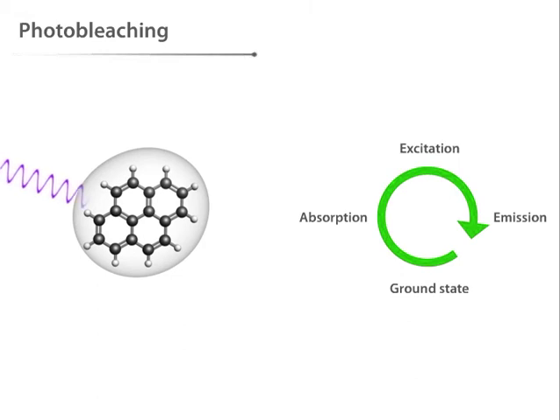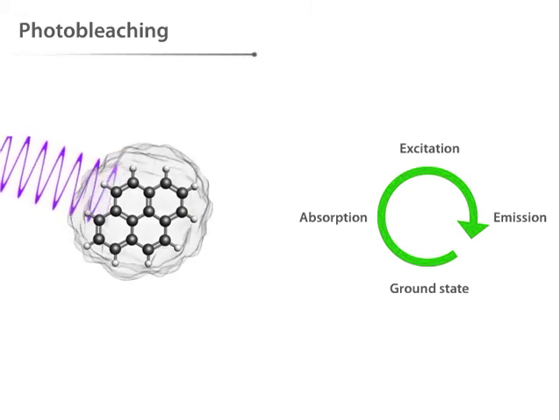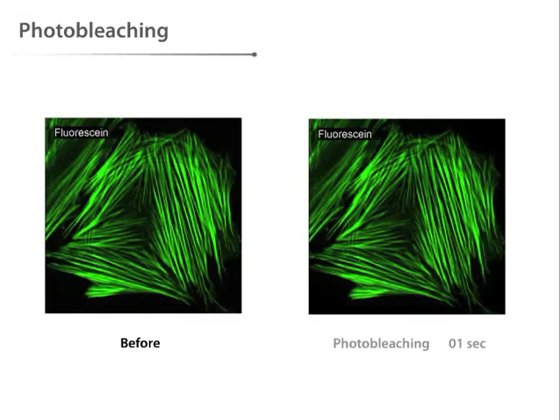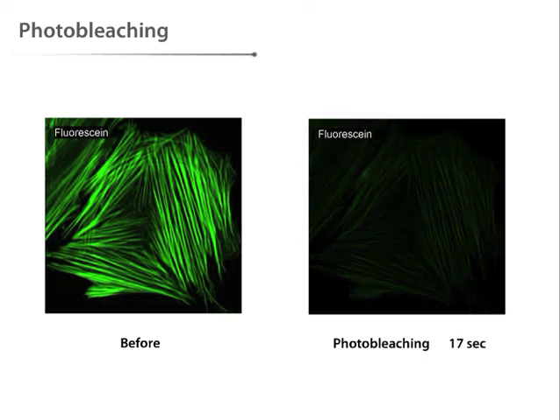In reality, however, the fluorophore's structural instability during the excited lifetime makes it susceptible to degradation. High-intensity illumination can cause the fluorophore to change its structure so that it can no longer fluoresce. This is called photobleaching. When a fluorescent sample, such as a slide with mounted tissue, is photobleached, the fluorophores are no longer promoted to an excited state, even when the required light energy is supplied.